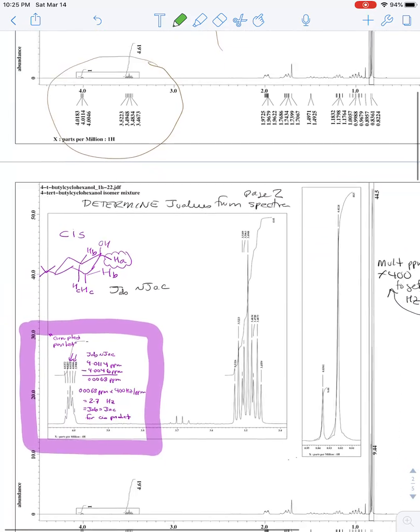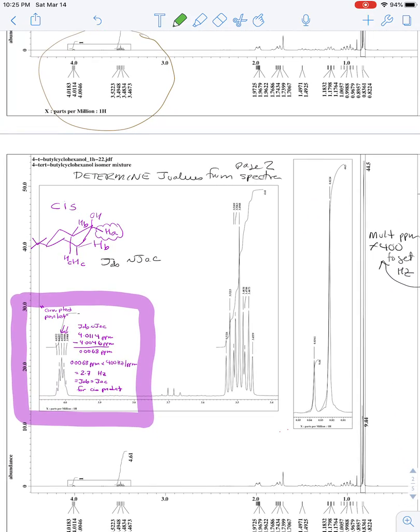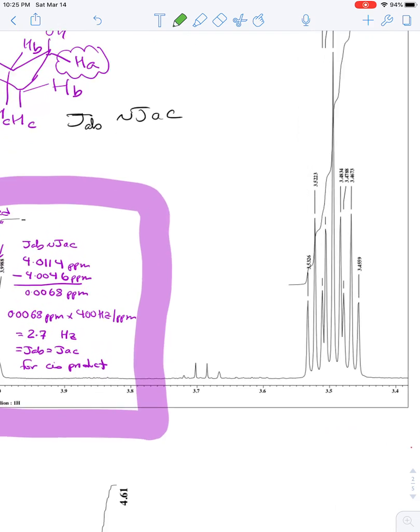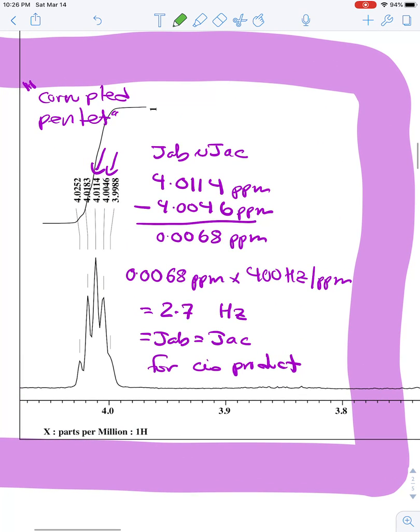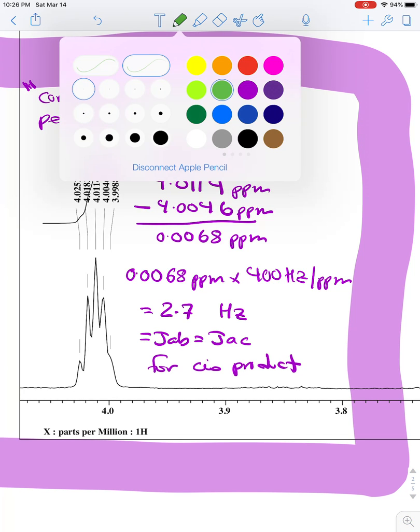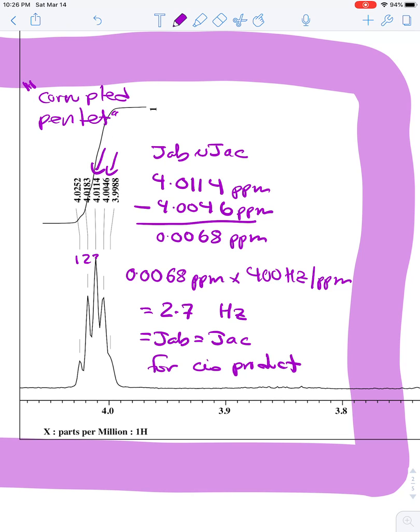So we'll go to the next spectrum, which is a copy of the first one, to calculate the coupling constants for this corrupted pentet. And so that's the only one that's shown here. And what we want to do is pick any two elements of this corrupted pentet. I picked the third and the fourth ones, because I thought the shoulder was maybe a little bit sketchy.